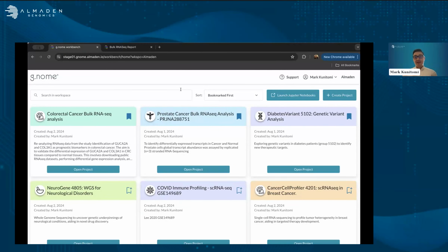Analyze those data quite rapidly using our guided workflows, check on the quality of that data, and then be able to iterate based on what you find to see that some of this data, although it's of high quality, needs batch correction to perform that additional analysis and then come back to your results. And I think that's really a key to exploring your data.